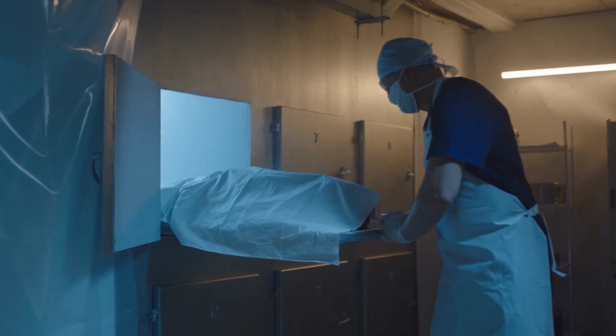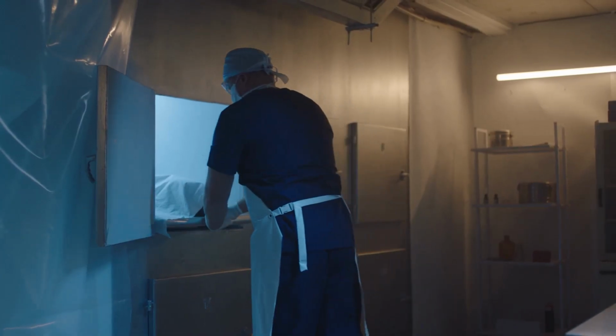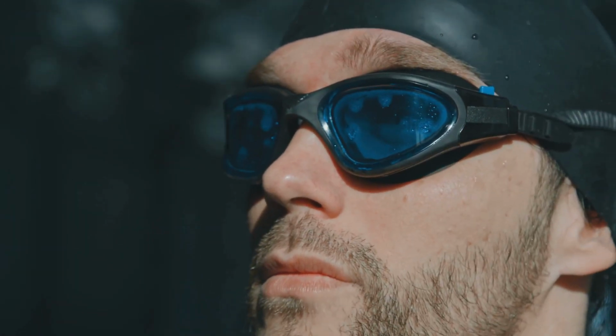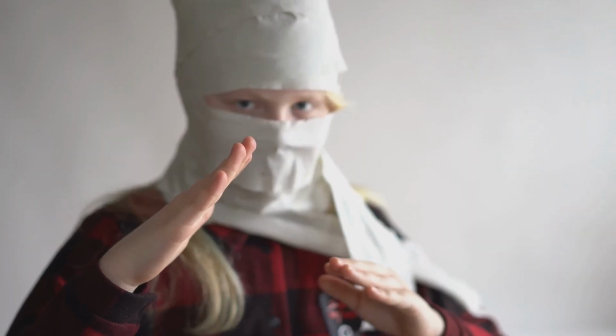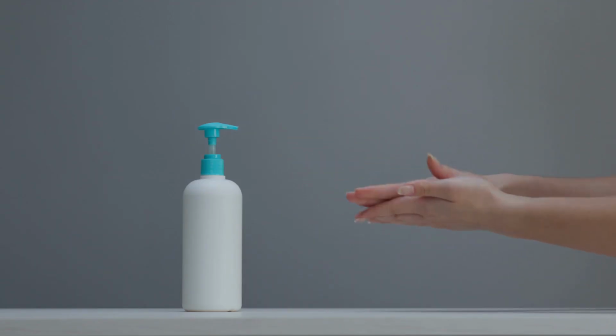If wearing a gown, untie it and pull it away from your body, touching the inside only. Remove eye protection by lifting the strap or earpieces from behind your head. Remove your mask last, using the straps, not the front. Immediately wash your hands or use sanitizer.